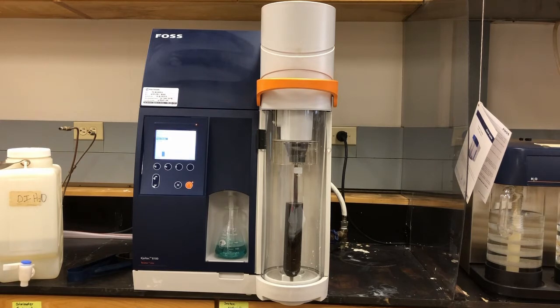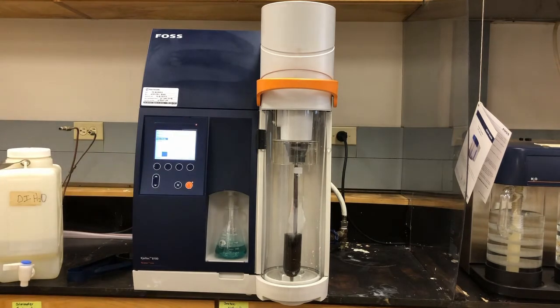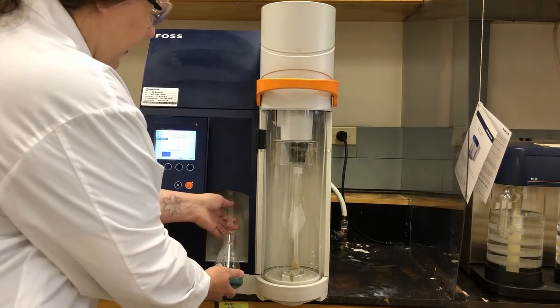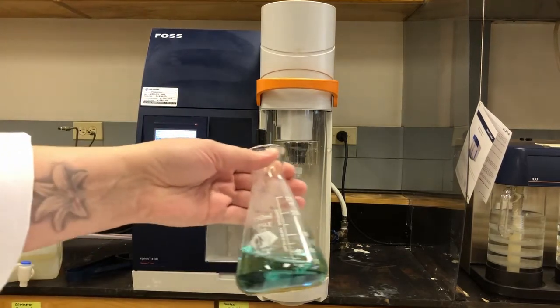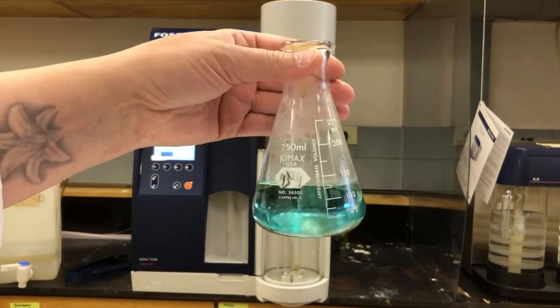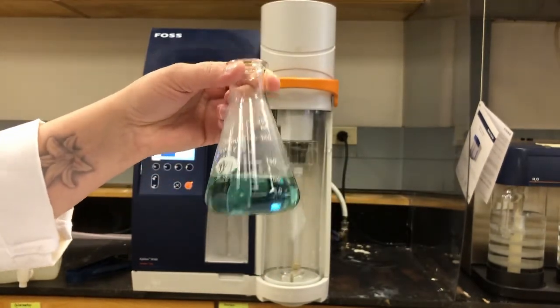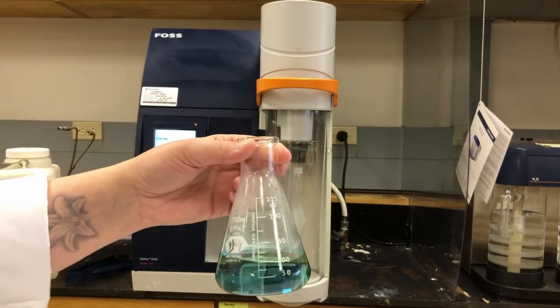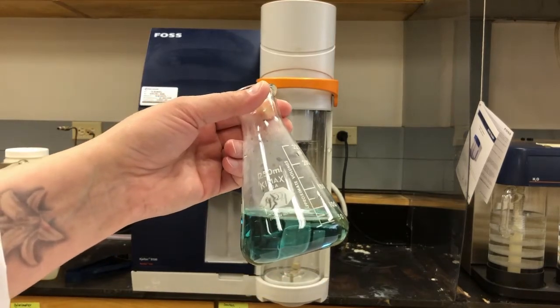Okay, so our distillation is complete, and you can see that this machine automatically drains our tube and dispenses that into waste. Our receiving flask you can take out, and you can see now that it has changed color. It's a greenish color as opposed to the red we had when we started. So that means that our ammonia has been condensed into the receiving flask, and now we're going to perform a titration with this solution.